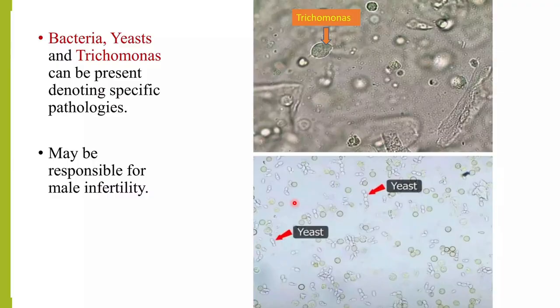Sometimes you will even see trichomonas, certain bacteria, yeasts, and fungi which will also appear as round cells. Here you can see a trichomonas which is looking like a round cell, and here you can see yeast cells which are round in appearance — so they may also be counted as round cells.